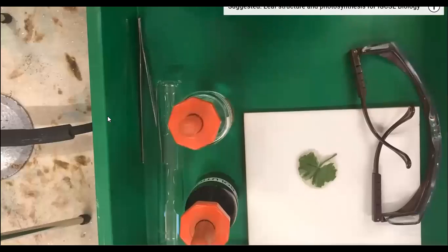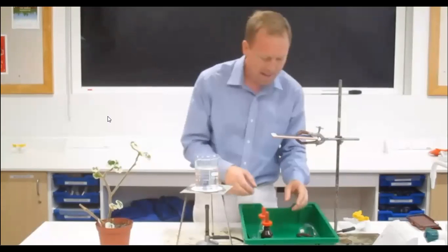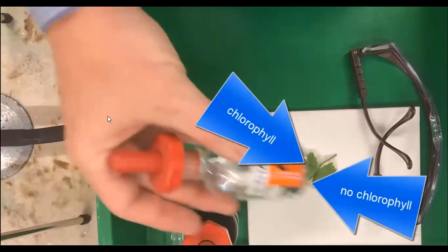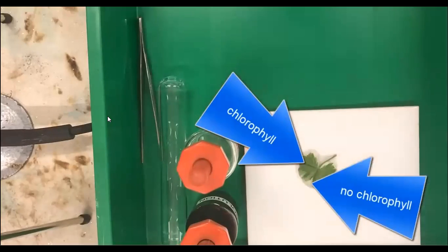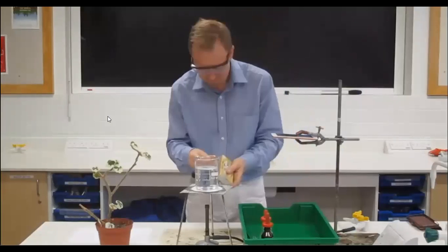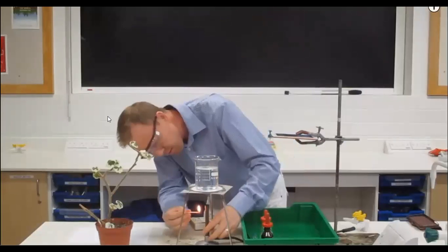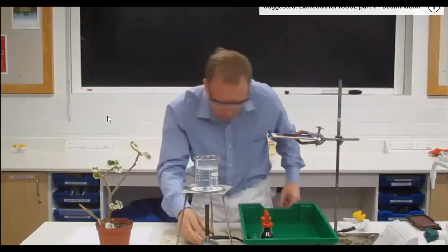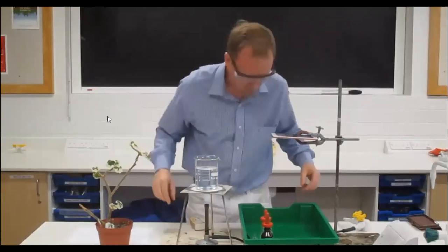In order to do this, we're going to need some hot water, we're going to need a tripod, heating equipment, and we're going to need some iodine solution and some ethanol and some safety specs. We'll don the safety specs now. Right. Let's get this water fully boiling. Lighting on safety flame, putting it onto full roaring blue flame. Let's get that heated up.